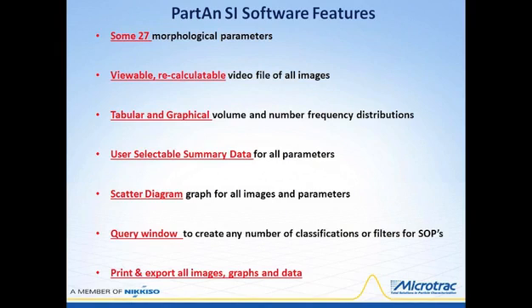A scatter diagram can quickly show how classifications of different components in the sample. A query window can be used to quickly evaluate different classifications for creating SOPs. And all data in the form of image files, graphs, and data tables can be readily exported to spreadsheet, copied, or printed. And finally, classifications to isolate separate sample components and filters to remove unwanted particles evaluated using the query window can be set up in SOPs. We'll touch in more detail on this and others later.